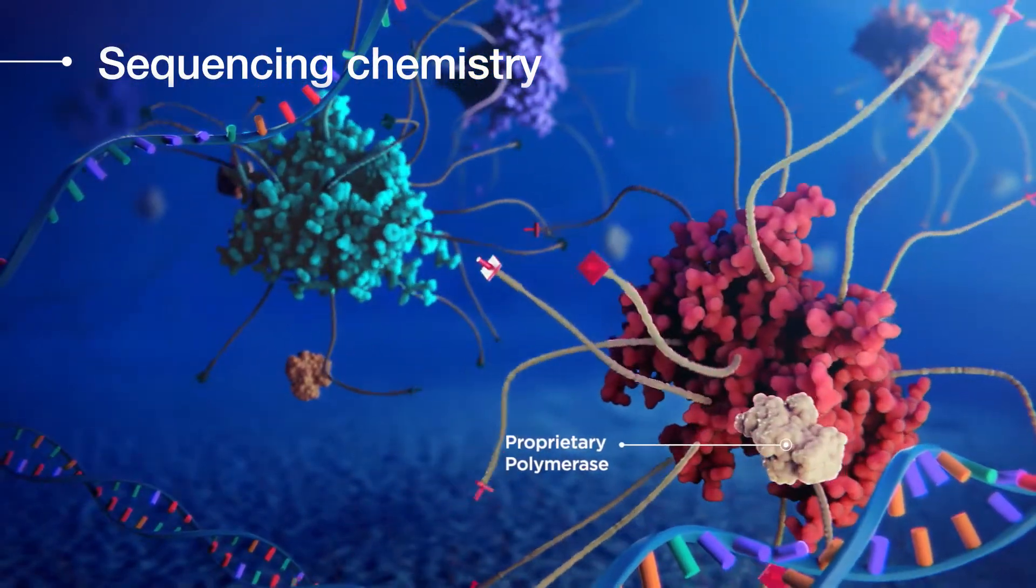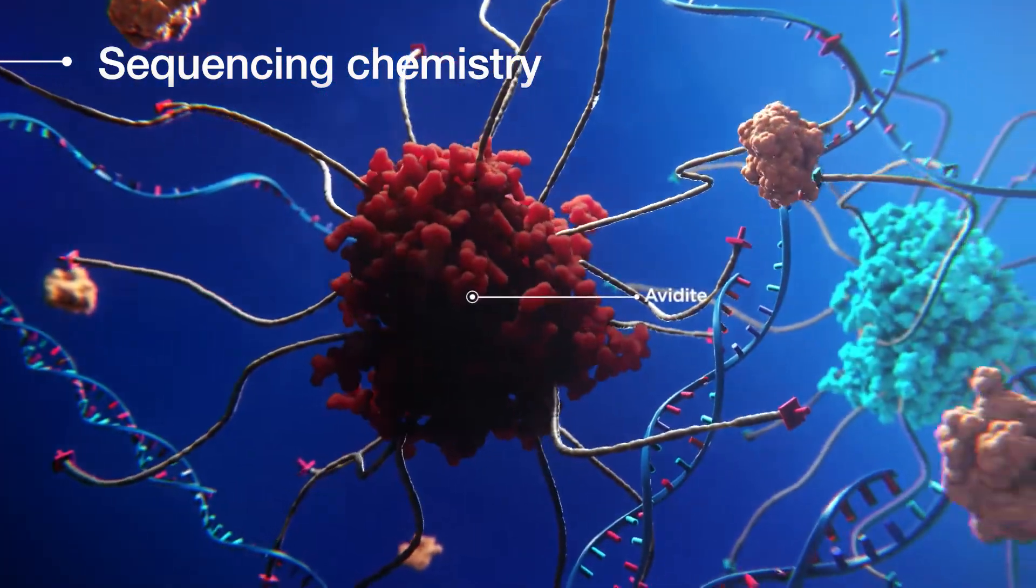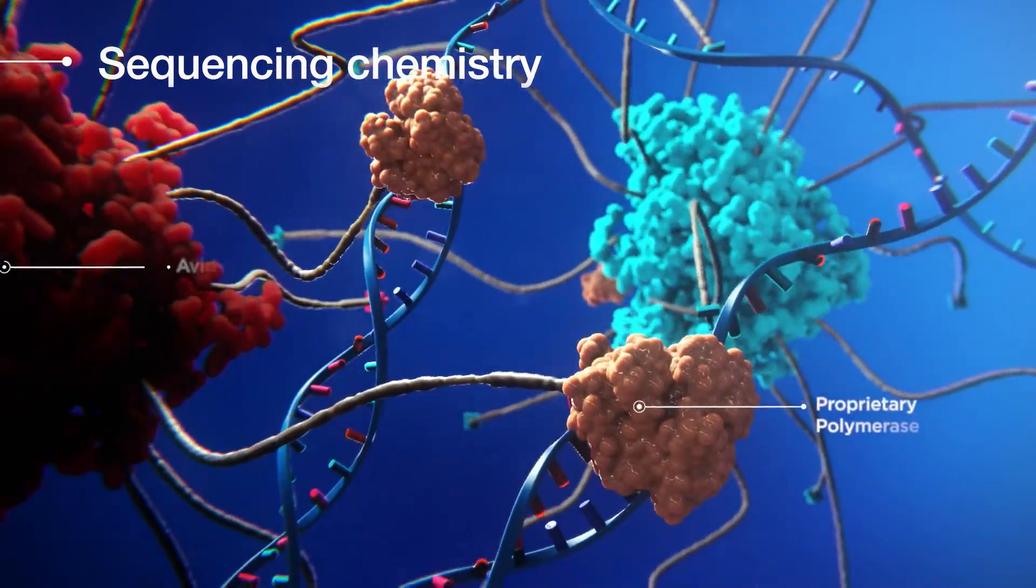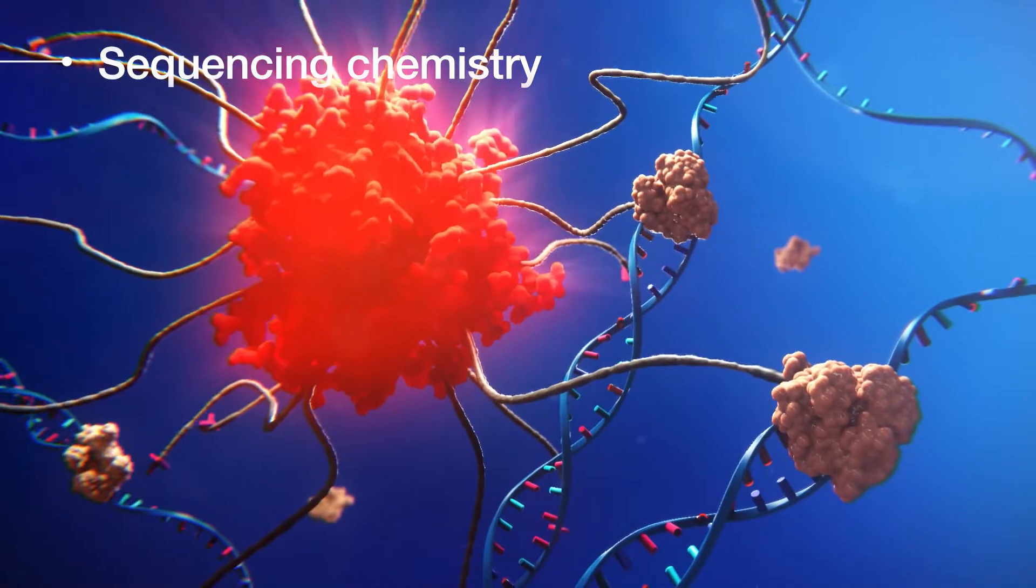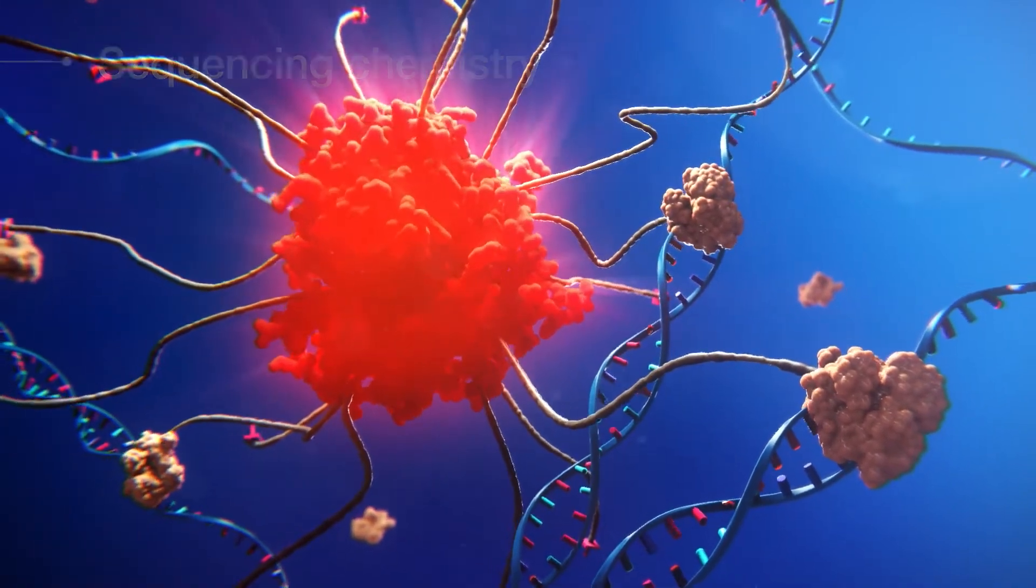Overcoming sequencing cost barriers. Using the amplified DNA templates, our proprietary enzyme selects the correct avidite, providing exceptional accuracy.